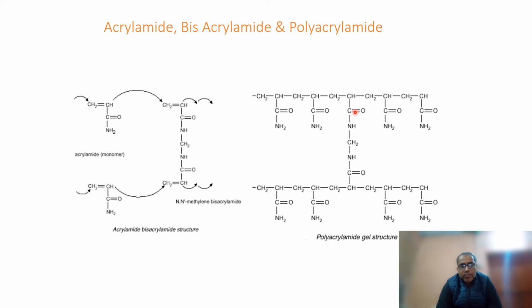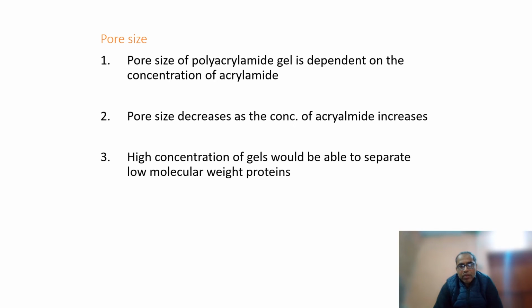That polymerization would take place and result in formation of the gel, which forms a sieve. The thickness of the acrylamide gel is just a few millimeters, while the agarose gel is quite thick compared with polyacrylamide gel.